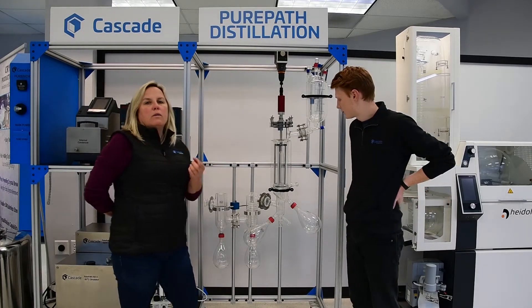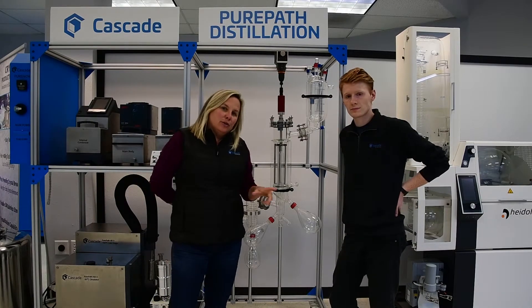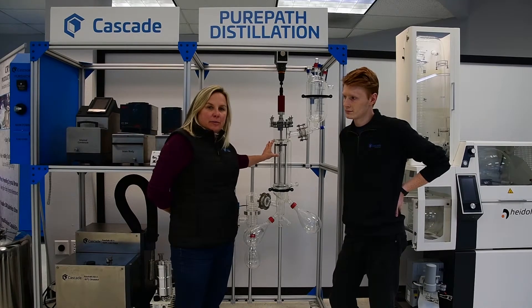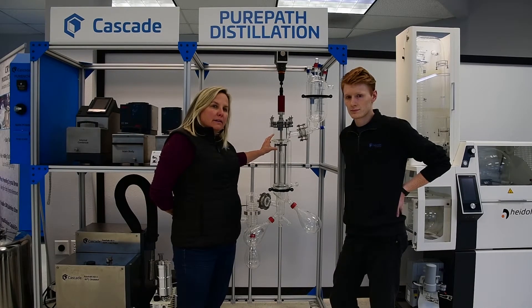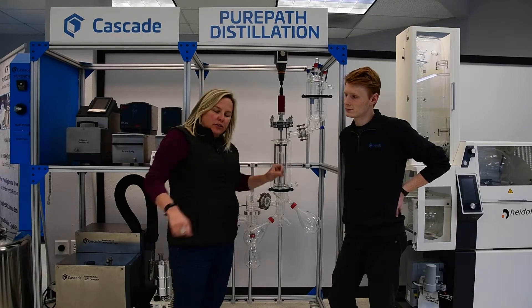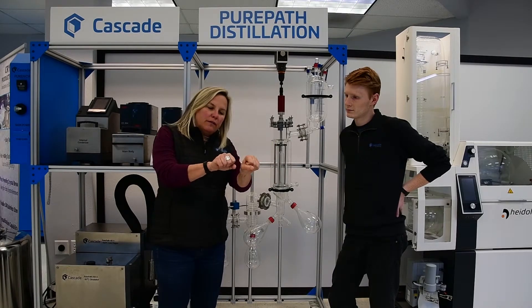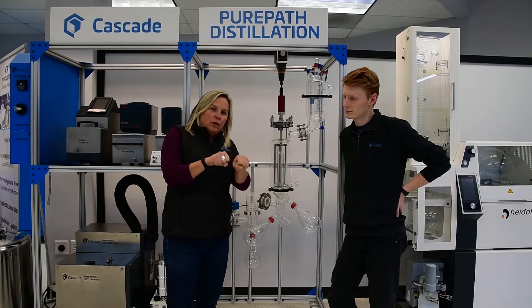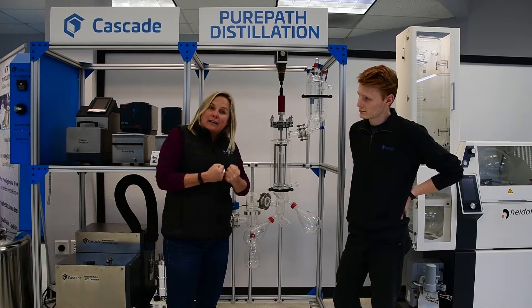One thing I'd like to bring up about why Cascade uses the Asahi glass — this is gorgeous, very high quality glass out of Japan — is that the vacuum integrity. It's such high quality glass, it's so smooth. The vacuum integrity on some of these joint and connection places really makes sure you get a fantastic vacuum.